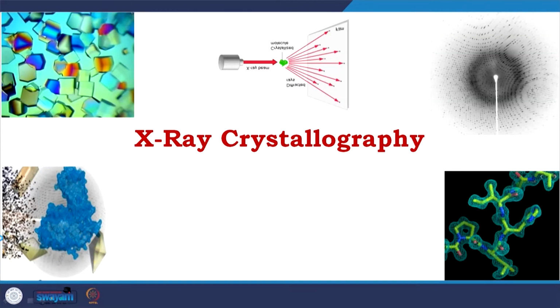Welcome to the course of structural biology again. We are in the new module, but we are still continuing with structural biology techniques, and we are still continuing with X-ray crystallography. Remember, we have talked about the invention of X-ray and what X-ray is doing. Now, we will start where the actual business is, how the X-ray would be produced.